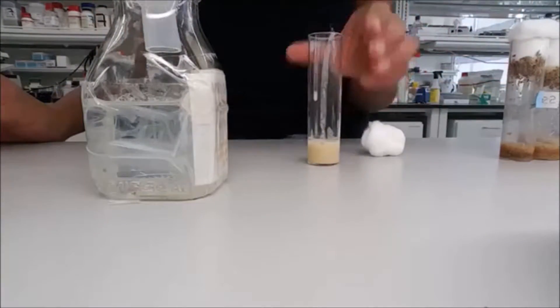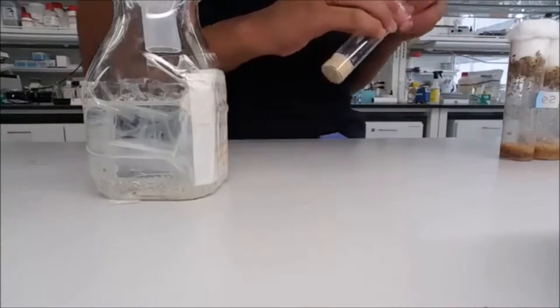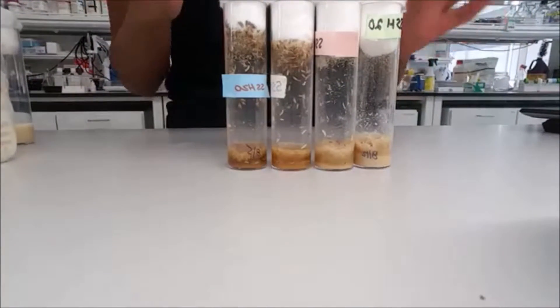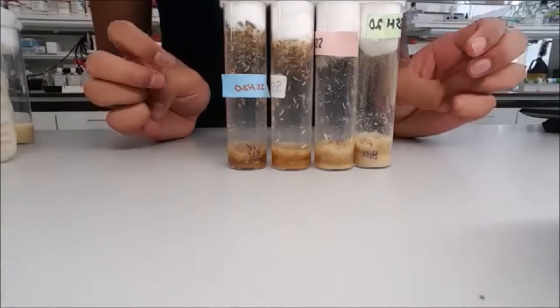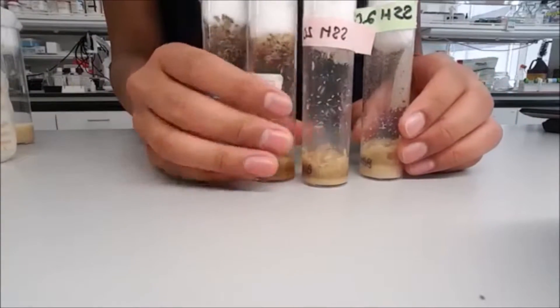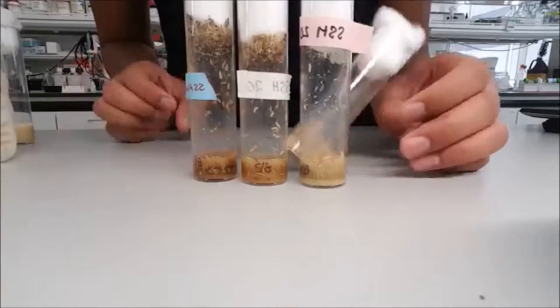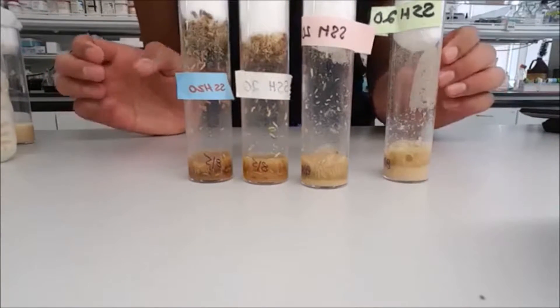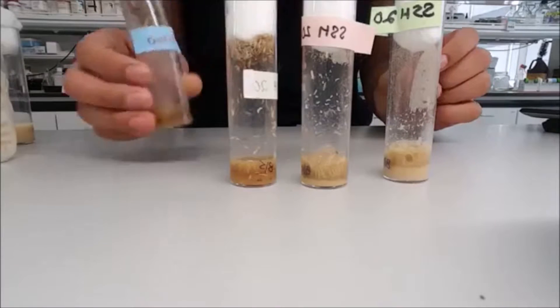Next, we're going to evaluate the state of each vial in the whole line. You have to make sure they're all from the same line. Here the line is SSH 20, and these are all from the same line, which is what we want.